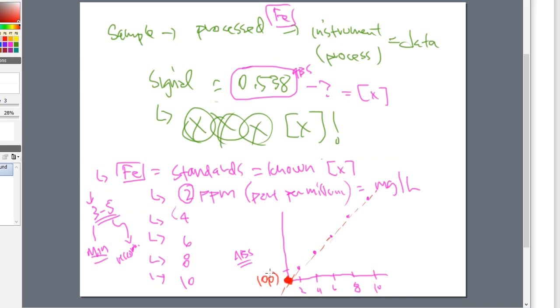And this should establish what we call a linear relationship. So my curve, for the most part, should be a straight line. If it's not a straight line, then that probably means I've messed up on the standard prep. And that means I probably need to go back and redo it all over. Without good calibration curves, you cannot do anything with your samples, anything with the surrogates, anything with the internal standards. You can't do anything at all. So calibration curves are at the heart of everything.